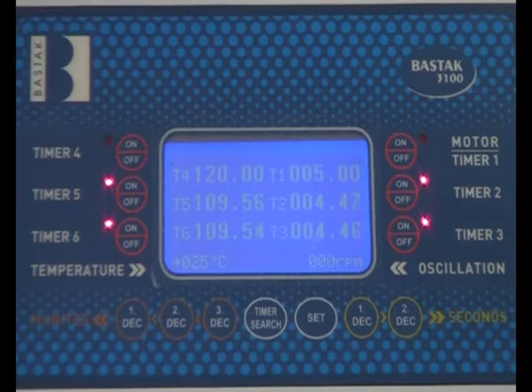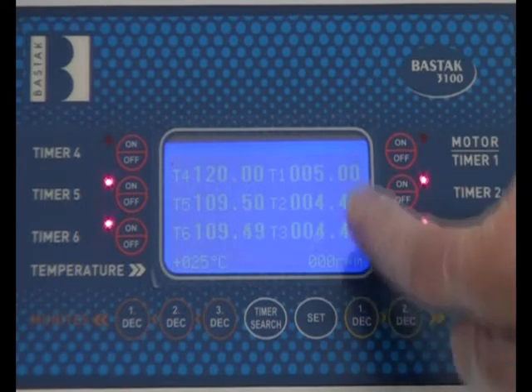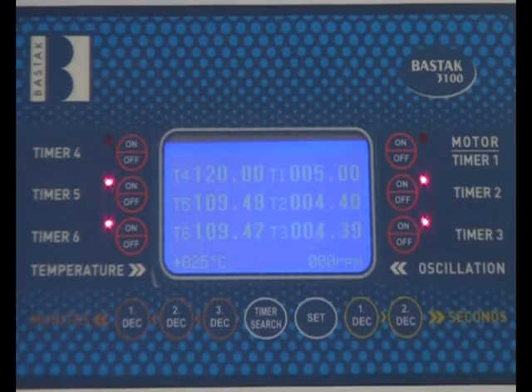During analysis, remaining time can be seen from the screen. If arranged time isn't changed, the last memorized time will be used automatically.